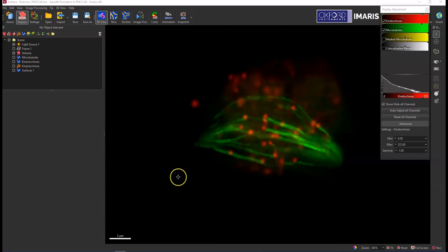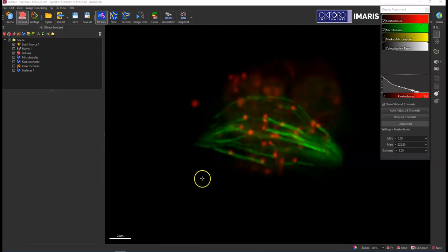Hi, so I'm going to show you how you can use object-object statistics to generate statistics that will show you how much overlap is occurring between two different surface objects, and also how you can use those surface objects to create mask channels that are specific to a surface that you can then use for any different number of applications.